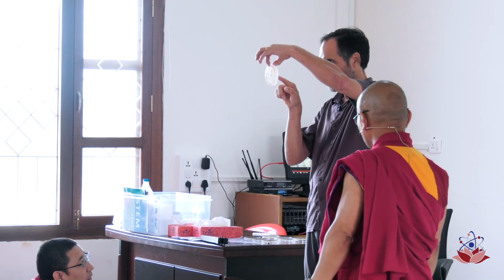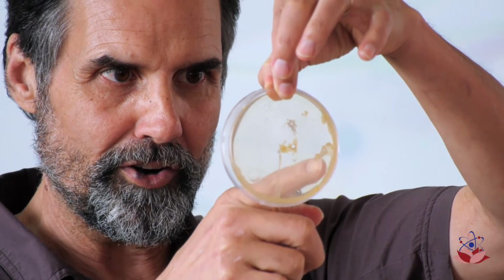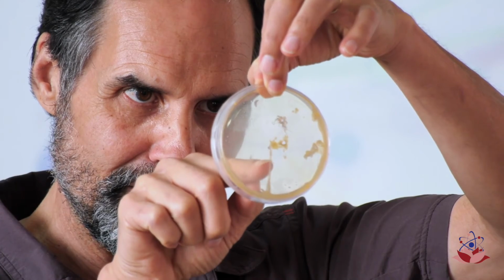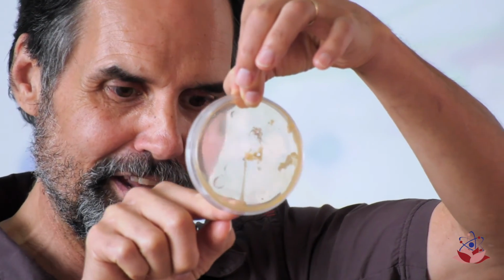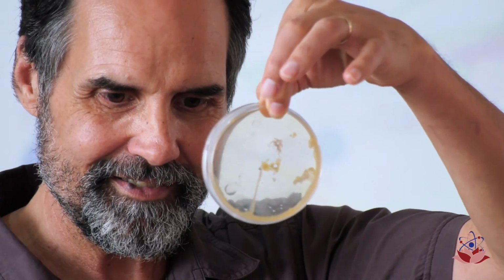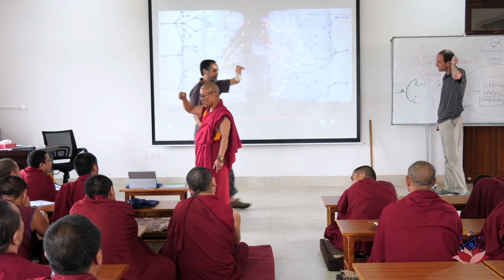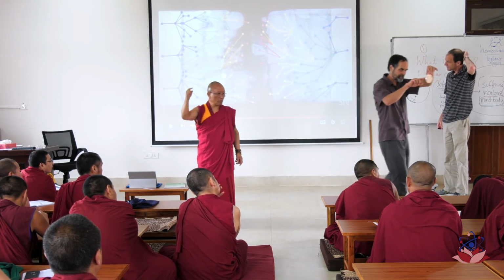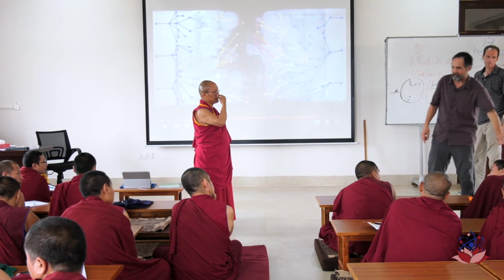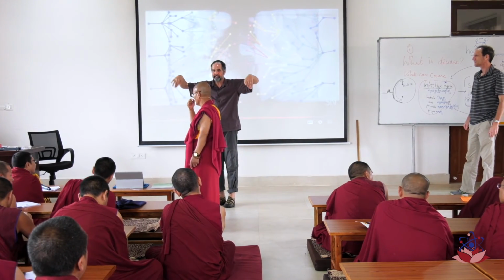Okay, so here's a colony, and then there was water all along here. And I think a water drop hit there, and it tracked along the water drop, and then it got a lot of water, and it just spread around the edge. Right? And so, remember, water likes to stick to edges. Water clings to edges.